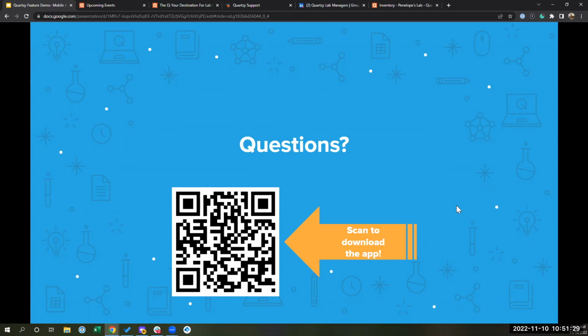You can, of course, create an item when you receive it, right? If it was the first time you ordered this item, it's your first time requesting it, the first time you receive it, you do have the ability to create the inventory item at that time. But in terms of a button that says create new item, that's going to be an addition at some point in the future. We'll put it on the roadmap as soon as we get a timeline specified for it.